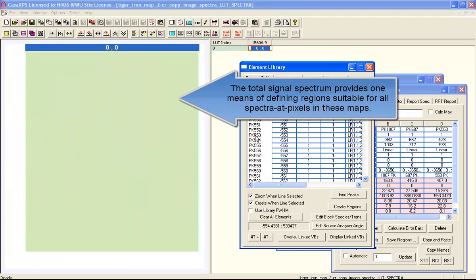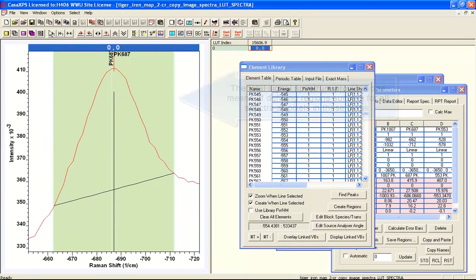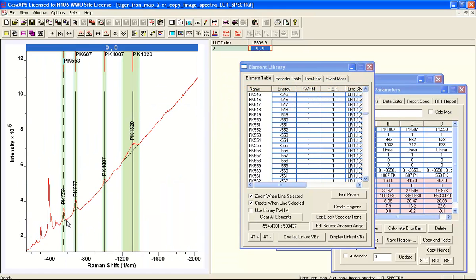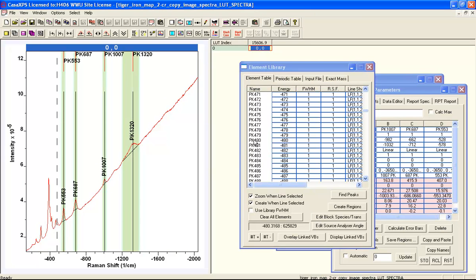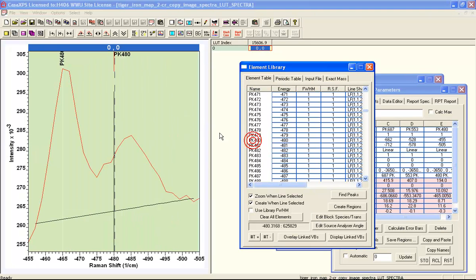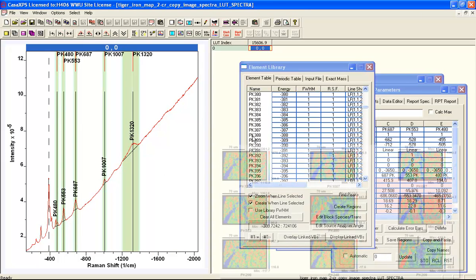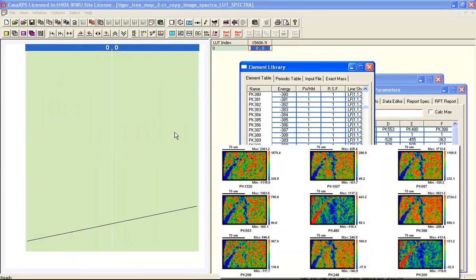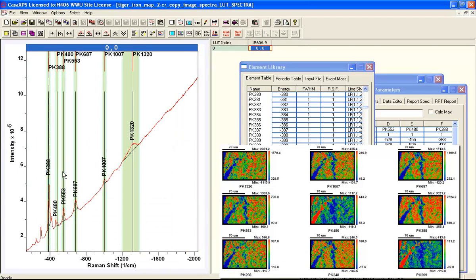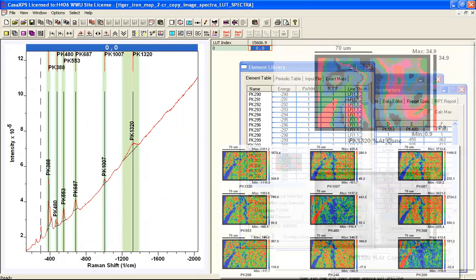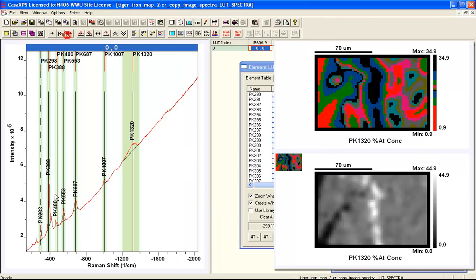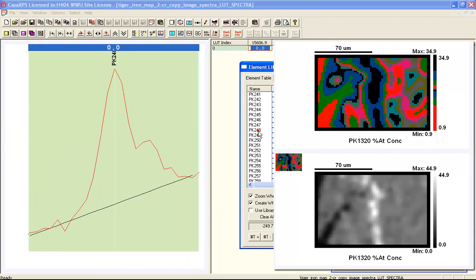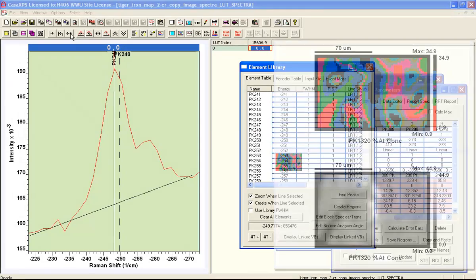We're using the element library to create these regions. We should end up with one region per spectral feature. You can see that some of these spectral features have component information. You could do this by peak fitting, but you end up with a set of images. From these images, you can calculate an image set of intensities, which you can partition as a false color image.